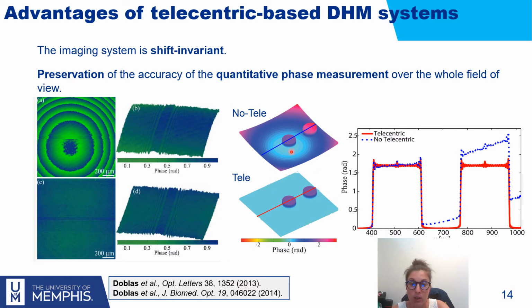However, for the non-telecentric case, I assume that we are 5 pixels off from the center, and then around 5%, less than 10% off of the curvature of the real microscope. This is an error that in an experimental environment is easy to get, since you don't have any prior knowledge about the quadratic phase factor at the center.